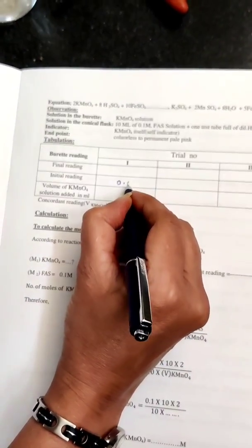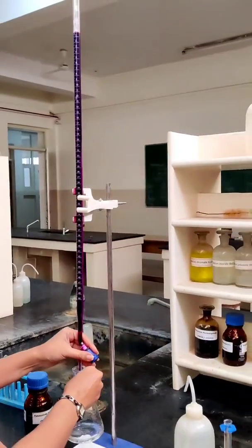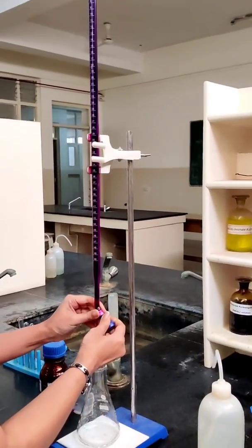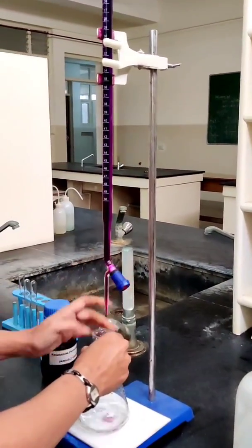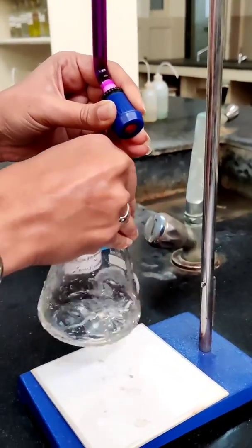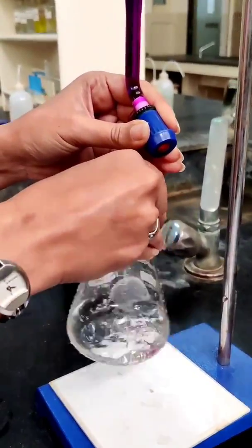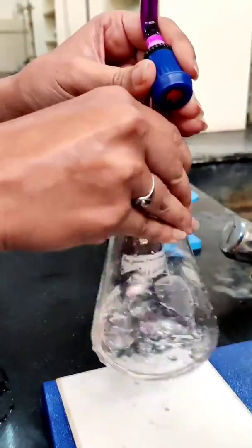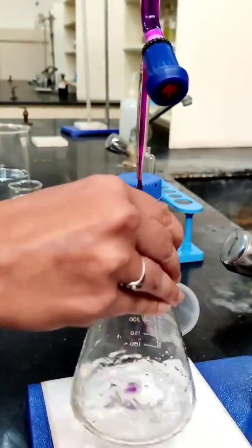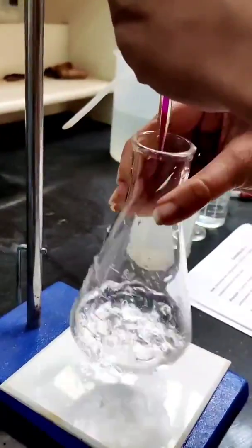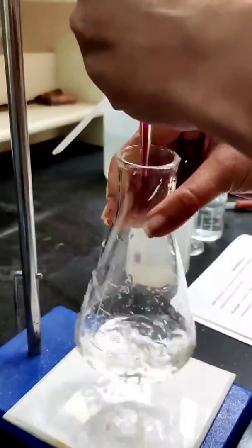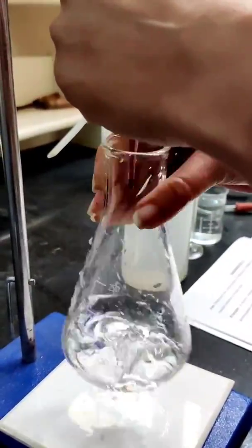Note down the initial reading in the tabular column. The solution is titrated against KMnO4 solution taken in the burette until the solution turns permanent pale pink color. Add dropwise until a permanent pale pink color is formed.